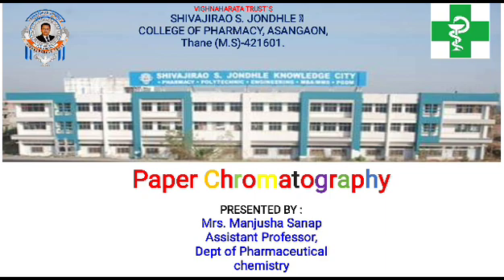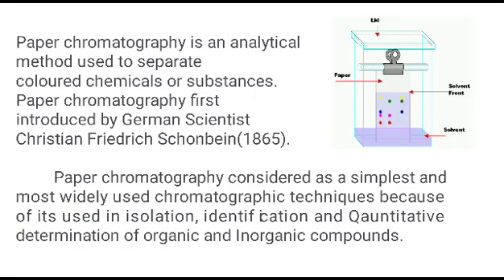Today's topic for my lecture is paper chromatography. Paper chromatography is a type of chromatography. Chromatography is a powerful separation method used to separate different mixtures. Paper chromatography is an analytical method to separate colored chemicals or substances.